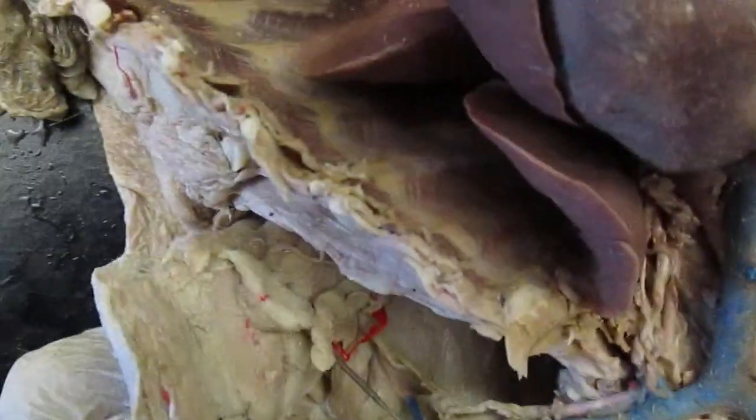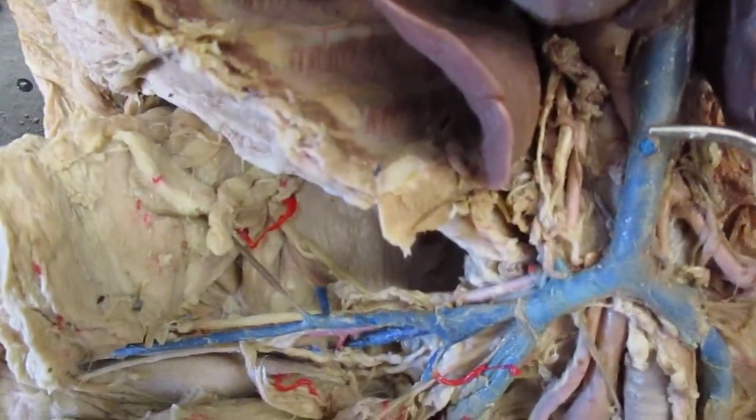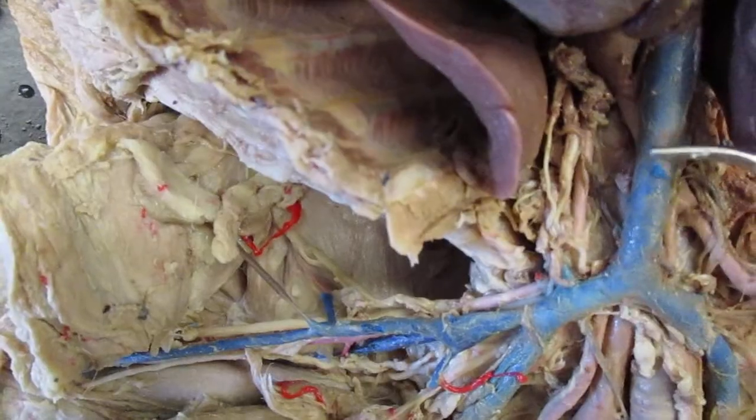Okay, now this structure right here, it's been broken. That's the azygos right there, and let's see if we can find it intact on another cat. So right here, right next to this lung here, this apical lung, you have the internal mammary artery or internal thoracic artery, and then you have your azygos vein right beside of it.